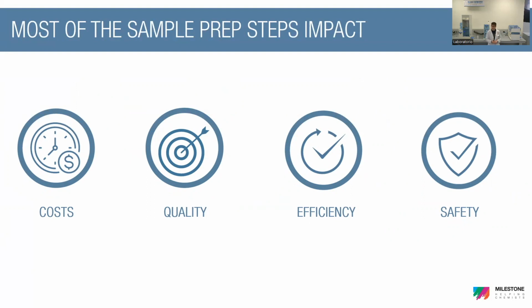If we talk about costs, you agree with me that any environmental lab is trying to keep the cost of analysis as low as possible in order to reduce the cost per sample. If we talk about quality, the goal of any environmental lab is to improve the limit of quantification to meet the requirements of most of the EPA and other official methods involving the environmental field, to improve the analytical blanks and to minimize interferences in order to get full recoveries of the target elements.